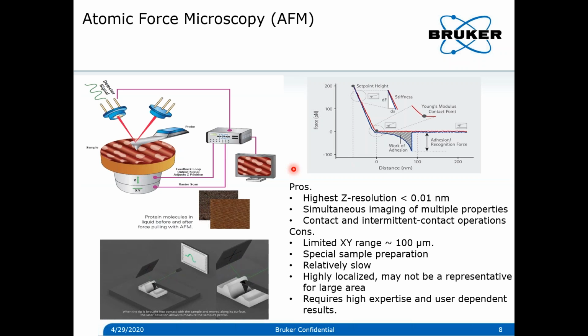One of the obvious answers would be an atomic force microscope. An AFM typically uses the deflection of a laser beam bounced back from the back of the AFM probe, which is then collected by a detector. The tip will be a diameter of a few nanometers. The deflection of the probe will monitor the surface. The probe will be connected to a piezo whose movement is controlled precisely using fast electronics.